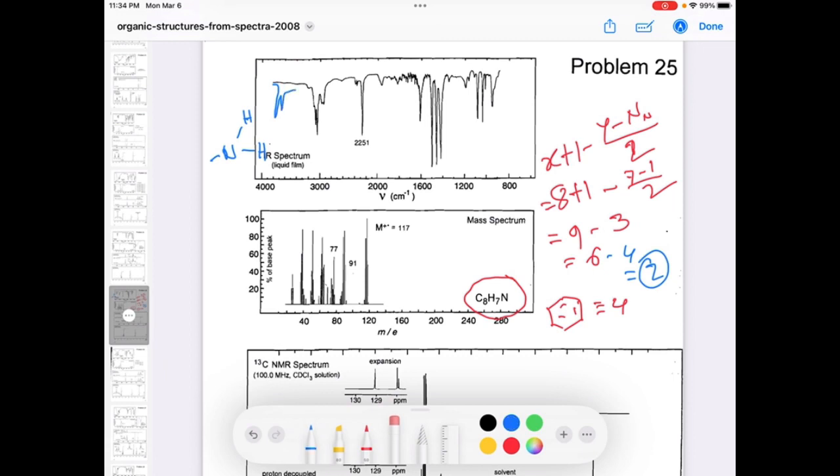If we think it is a secondary amine, so if we have two alkyl groups or two connecting groups and one nitrogen, we still should have one band in the same region. There is no band there too.